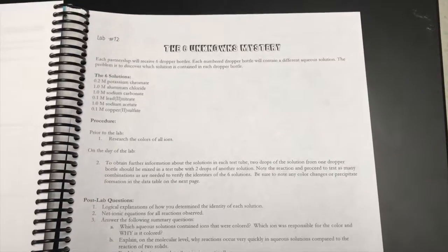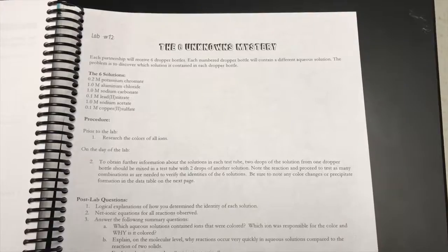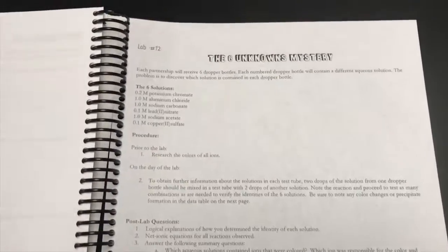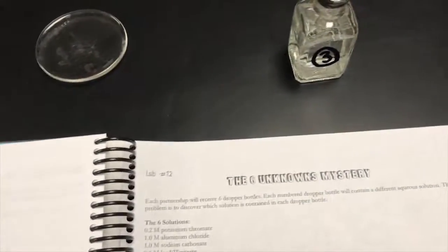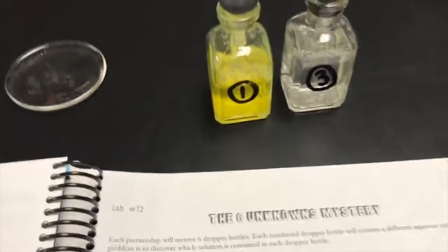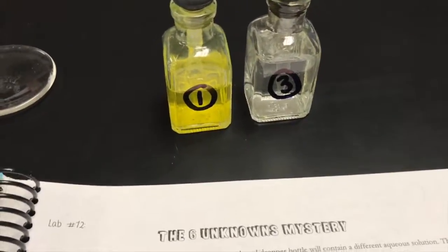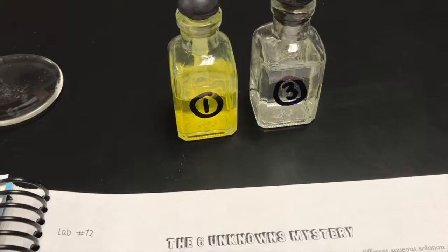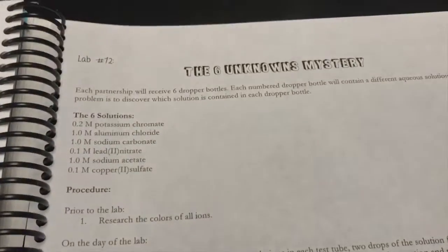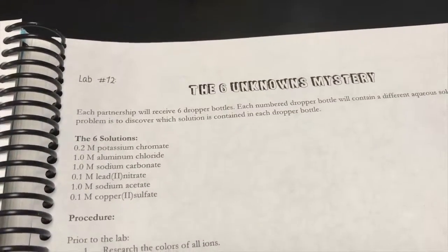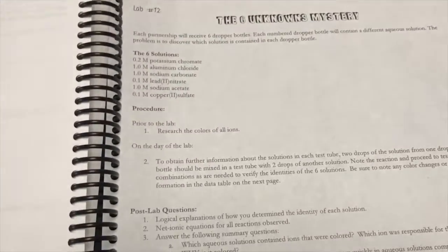In this laboratory experiment, you're going to have six unknown solutions. You'll notice on the lab bench there are dropper bottles with specific numbers, and your job is to figure out the identity of all six solutions using your solubility rules and double replacement reactions.